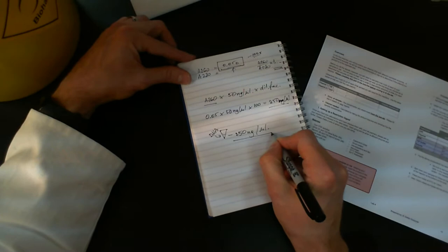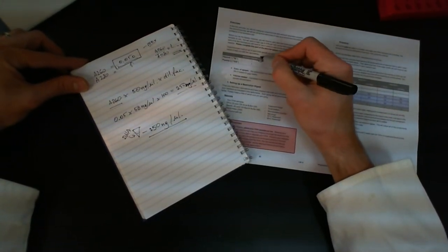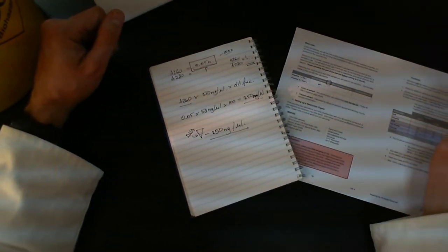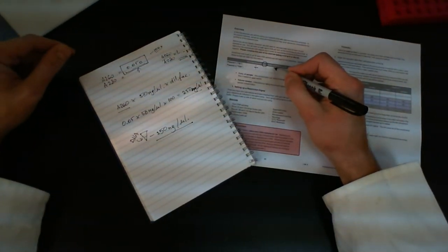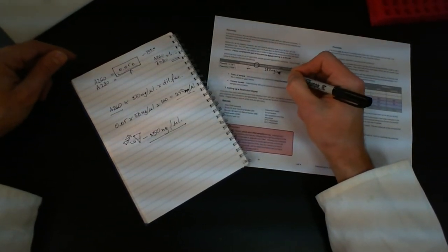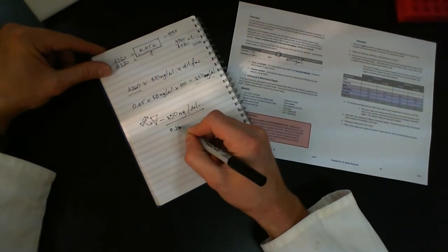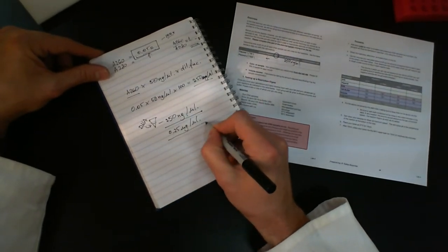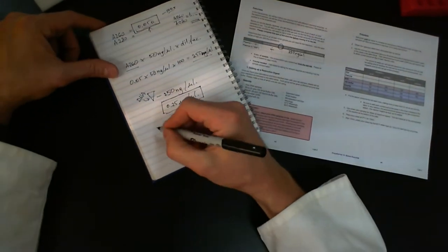Now, if you look at this table, I am asking you to use 1 microgram of DNA for your digests. So how do you figure this out? The concentration of your sample would be, for example, 250 nanograms per microliter. That's the same thing as saying 0.25 micrograms per microliter. That might be a bit more useful for this.